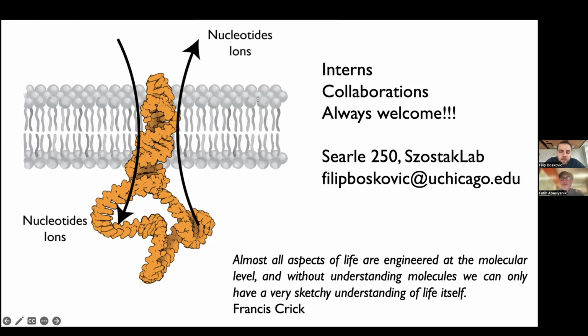So Benjamin has a question. Can you elaborate on how to implement adaptive sampling? Does Oxford Nanopore provide software that makes it easy to do? Any special computer needed? No. It's actually when you enter the device, you start sequencing. It will ask you which kit you are using. Do you have a reference sample? Can you choose it? Can you let me know how long I should sequence? You can either say how long or how much data I should sequence. So you can say if you collect 1 gigabyte, stop the measurement. That's usually enough for your sample.